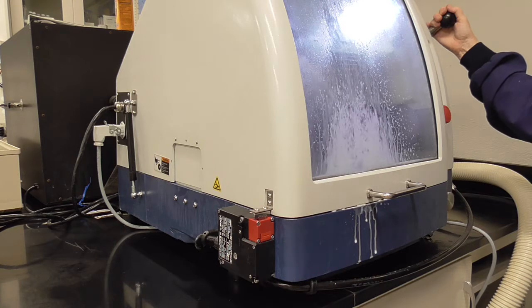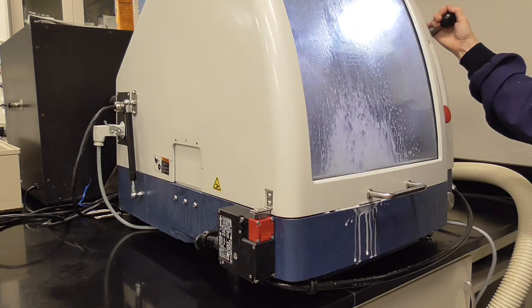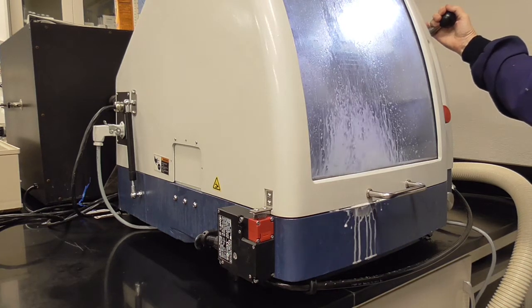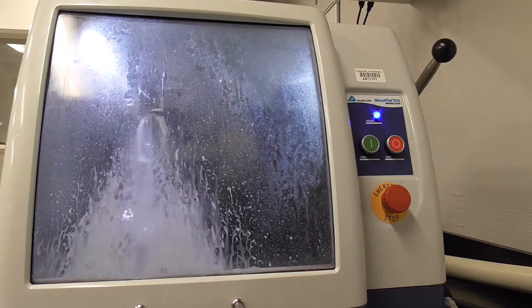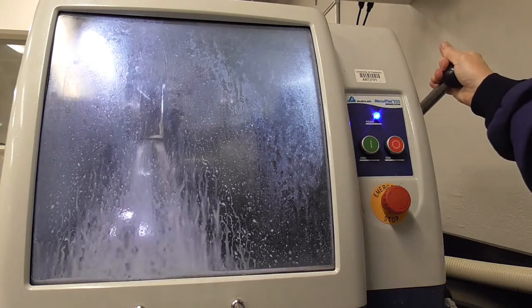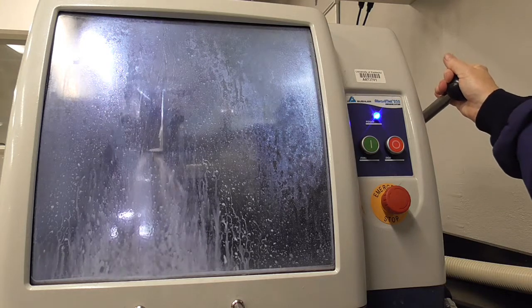You need to wait one minute for the blade to get to speed. Once the blade has got to speed, you pull the lever down, positioning the blade on your sample.